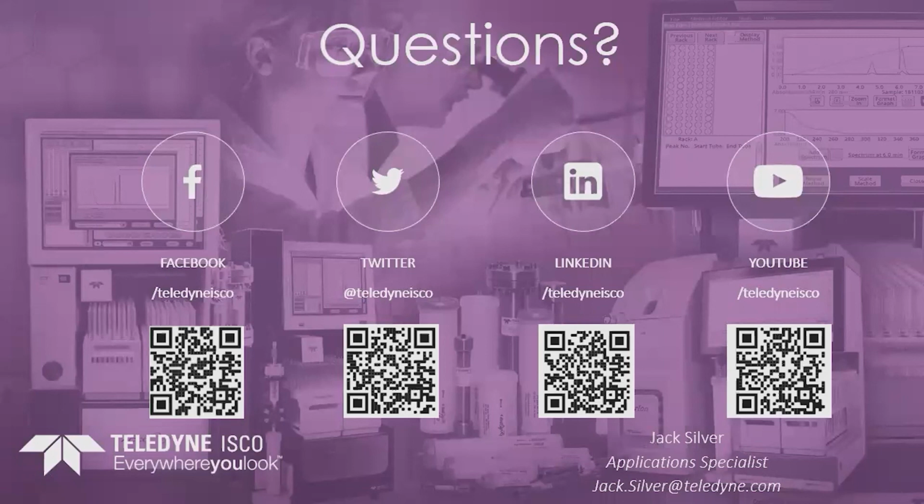Another question is, can we reuse columns? And I presume you mean silica gel, because the reverse phase columns can be reused many times. We don't usually recommend it because if you leave the column in the solvent for too long, the column body swells up and it doesn't stay packed very well. And that's true for any manufacturer's flash column, because we use the same material for the outer column body.